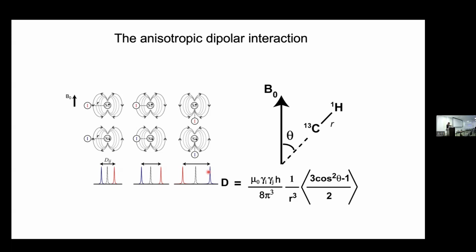So the NH will enjoy better T2s because of the weaker nature of the dipolar interaction, which on the other hand is something that's interesting, right? So there's an interesting trade-off. You can try to make the coupling bigger, but that will come at the expense of a bigger dipolar contribution to T2. And you can do the analysis, and probably this will depend on the correlation time of your molecule and the accounting of the CSA.